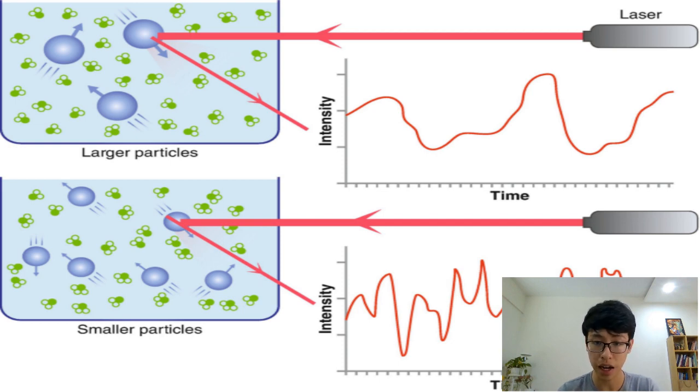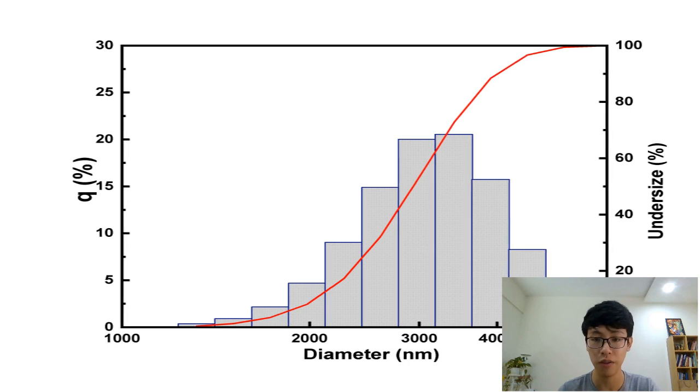And how that light scatters generates data from the DLS method. And from that data, particle size can be extrapolated, calculated using formulas that are automated by software. At the end, you will receive a graph detailing the composition, the size distribution of your sample.